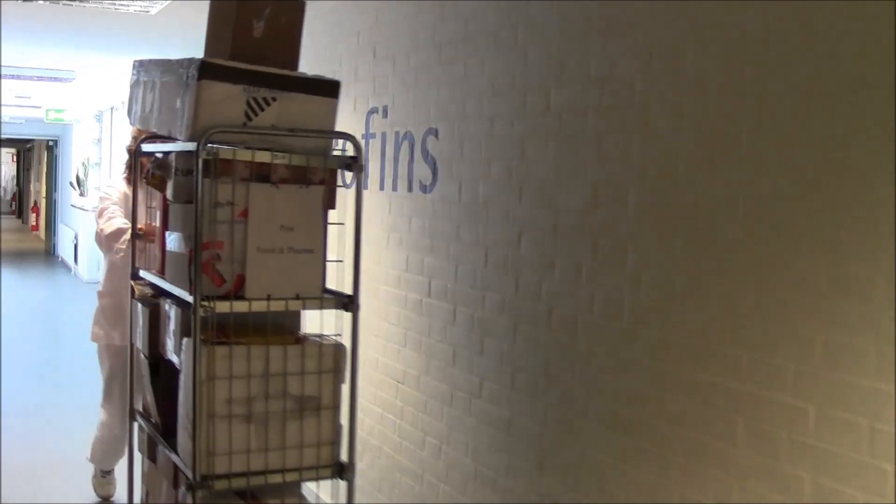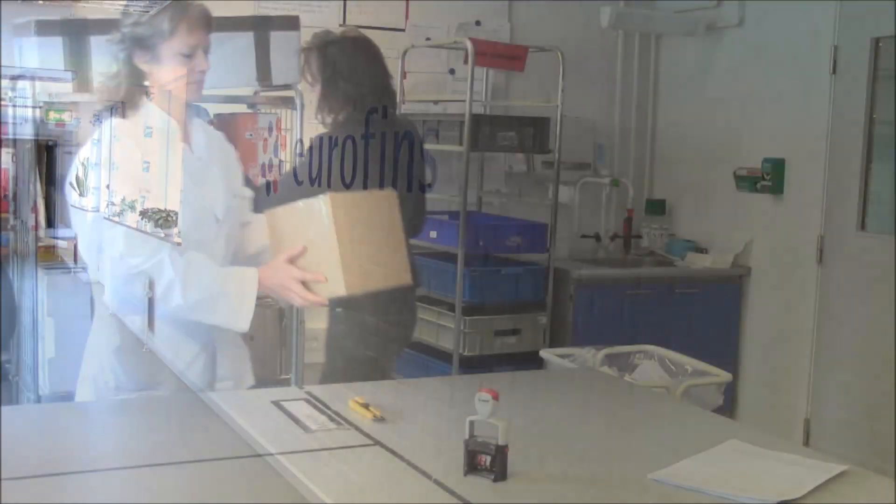When packages are delivered to the site in Vine, they are sorted and placed on trolleys for pickup.